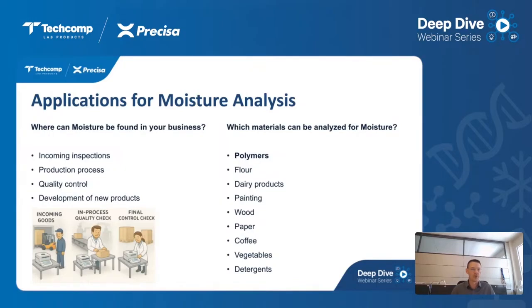Also, it plays an important role in the development of new products, where several iterations are needed to determine the perfect moisture content for your product.